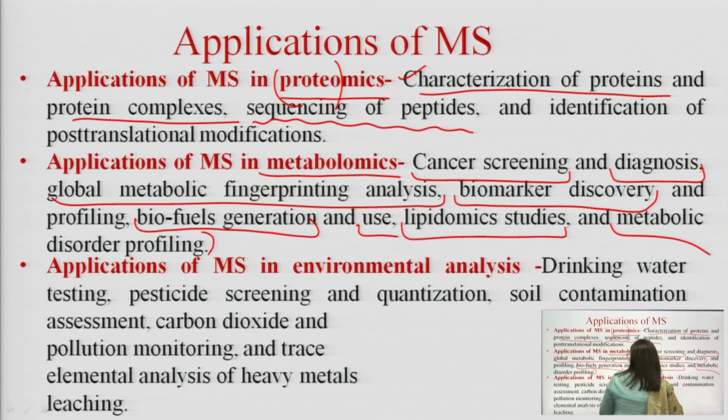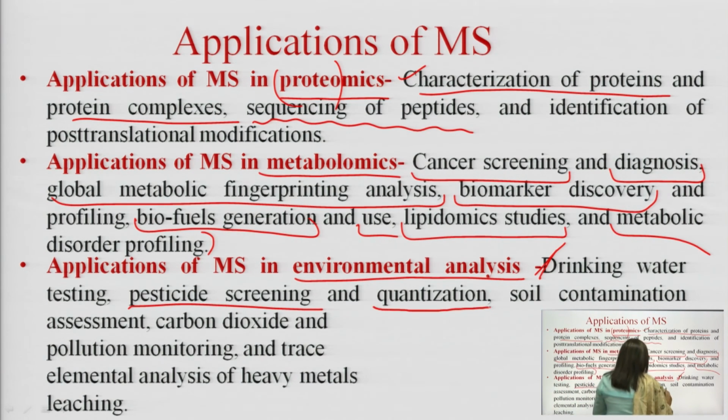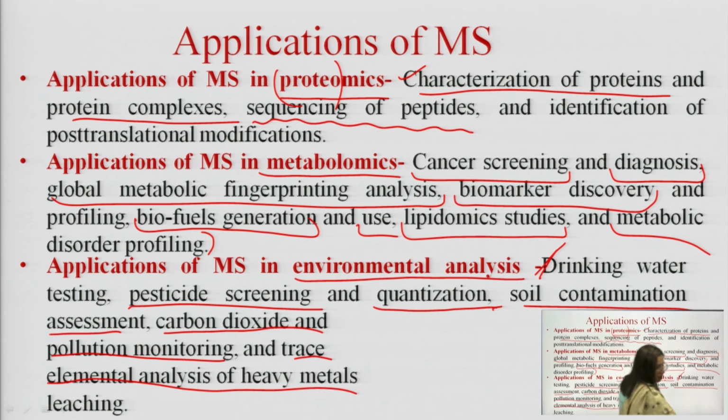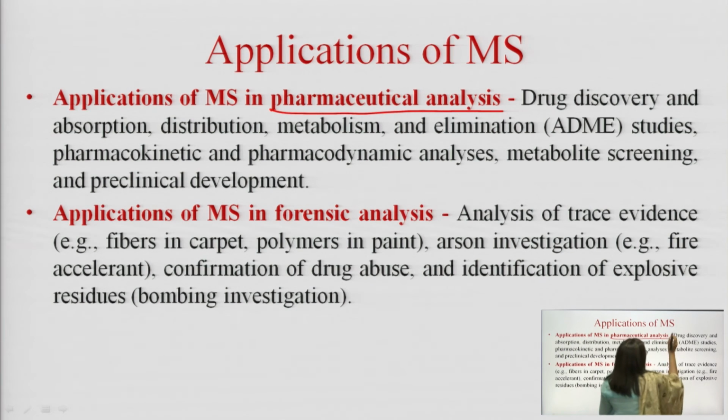immensely important. Then we have the application of MS in environmental analysis like drinking water testing, pesticide screening, quantization, soil contamination assessment, carbon dioxide and pollution monitoring and trace elemental analysis of heavy metal leaching. Next is the application of MS in pharmaceutical analysis.